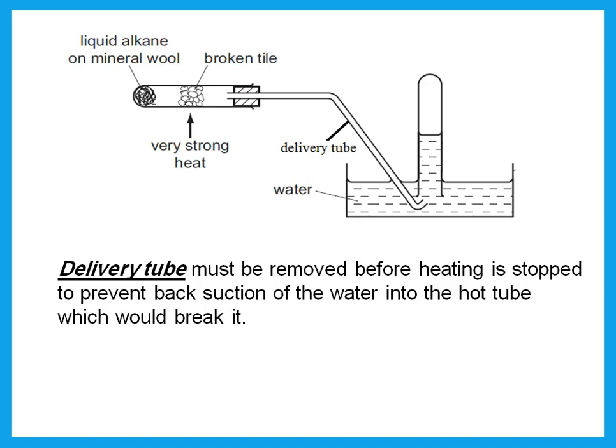Now, if I remove the heat with all the setup the same, with the delivery tube inside the water, then the gas in the test tube will cool and it will suck water back into the hot tube, and that means the hot tube will break.